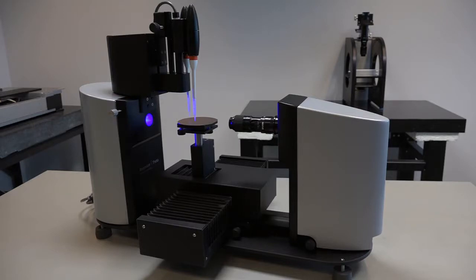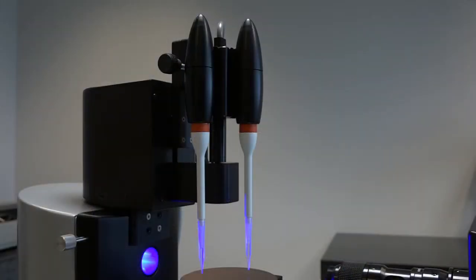It is extremely easy to do automated surface energy measurements or contact angle mappings by using the Attension Theta with two automated disposable tip dispensers. The disposable tip dispensers use disposable pipette tips that can be disposed after use, removing the need for any cleaning.